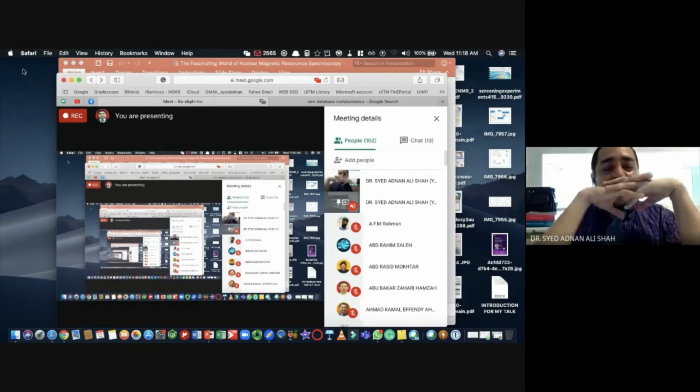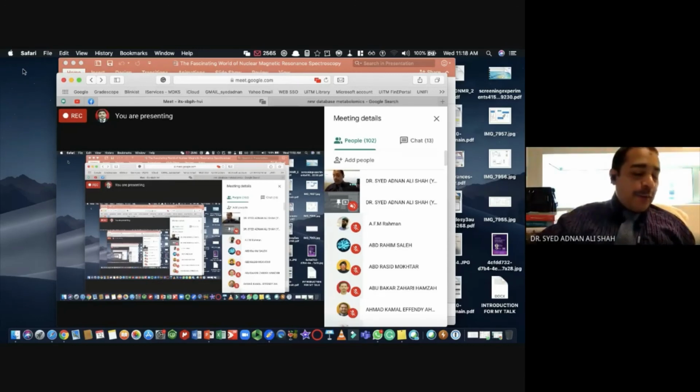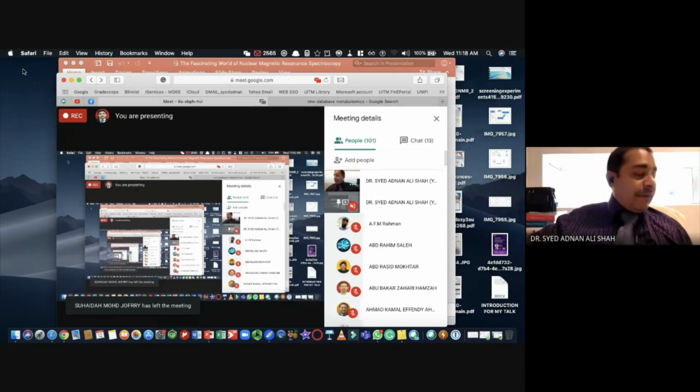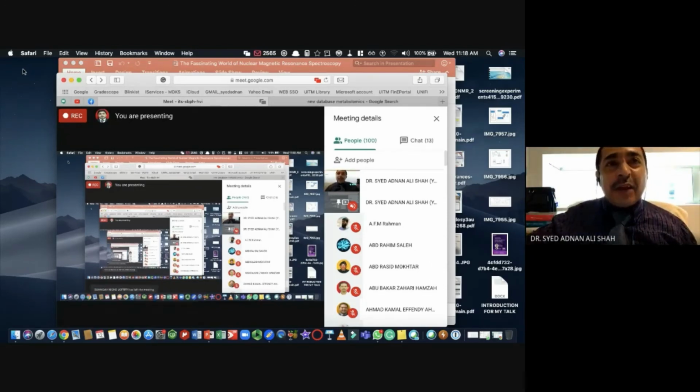Yes, interesting question, but we are interested in the NMR active nuclei, right? And RNA is ribonucleic acid, right? So of course it has pyrimidine, it has uracil, it has guanine, it has adenosine, it has cytosine. These all contain nitrogen-15. These all contain hydrogen. Because of this hydrogen and this nitrogen, the structure of RNA can be easily elucidated, because it contains hydrogen and nitrogen-15, right?